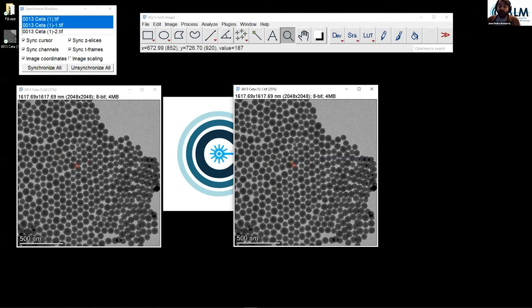or try to segment these objects. So visually, we can see that we have particles in this image. And we just want to get an idea, first of all, how many, how big they are, what's the intensity inside each object. So these are all things that we can do with Fiji, much like we did also with the Jupyter notebook approach. So now this is where things can get interesting.